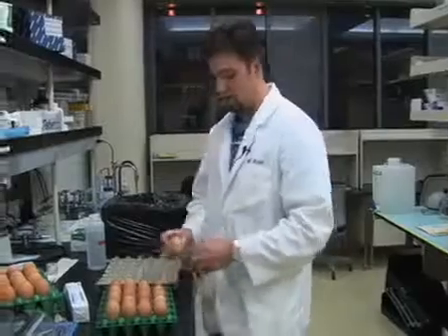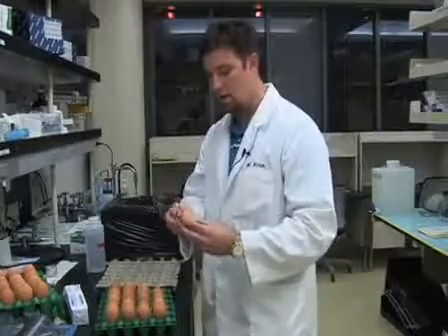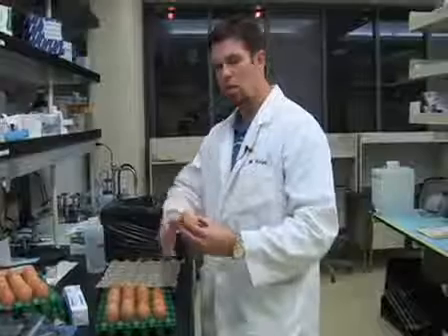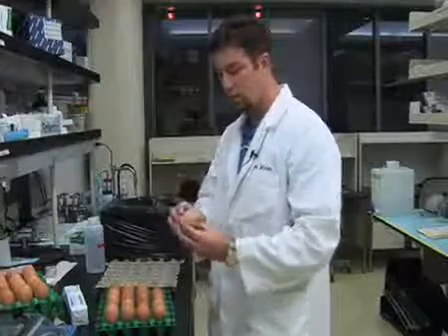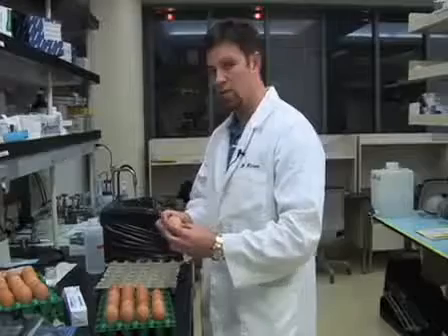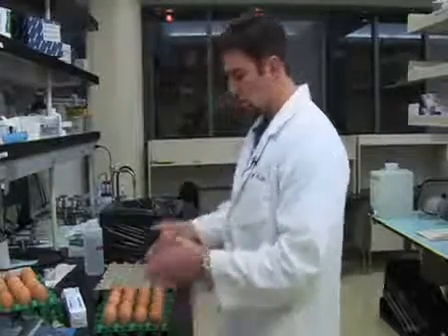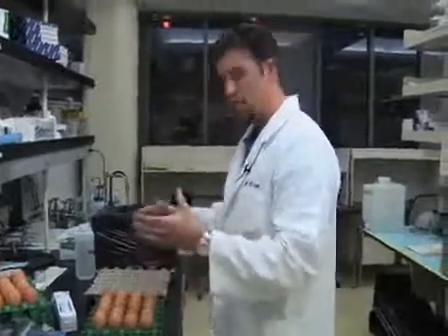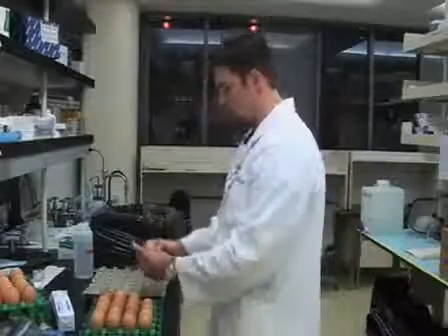We're going to go ahead and clean the egg. There are a lot of things that could be on it from the incubator. We're going to be sealing it with tape, and we don't want any small bits getting around where the window's going to be, getting into the egg and increasing the chance that the embryo will die by the time we want to take it out. The eggs are sitting with the big side facing up, so we're going to turn each egg to the side.